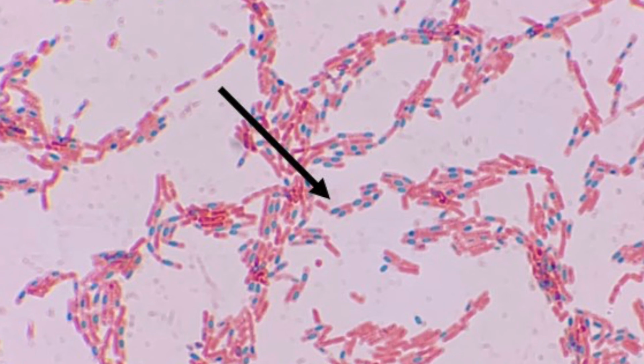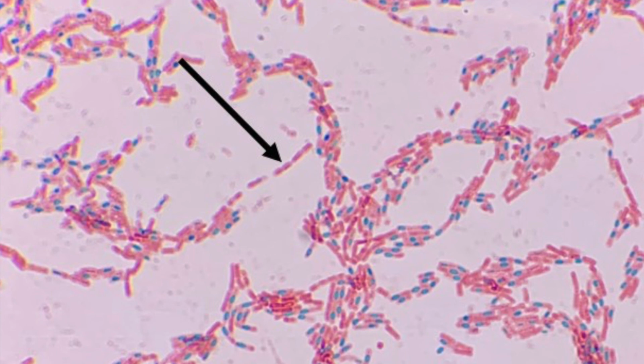And you can also, if you look really close, you can see that the location of these spores are subterminal. So whenever I was talking about the three different locations, you have centrally located, subterminal, and terminal. These spores are subterminal, and that helps us to identify what kind of bacillus this is. And then if you have the pink cells that are only pink, then these are going to be the vegetative cells that have not undergone sporulation yet.